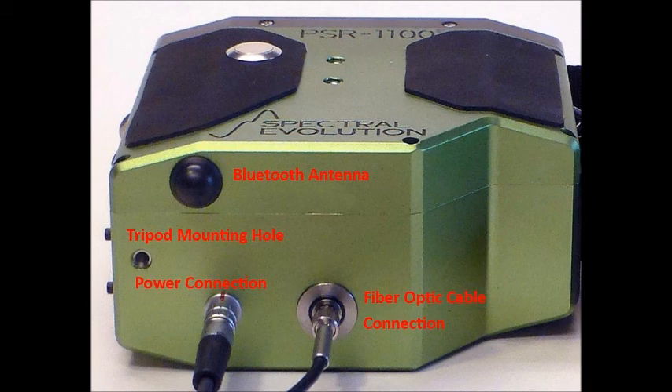The bottom has a Bluetooth antenna, connections for the power cable and the fiber optic cable, and a standard tripod mounting hole.